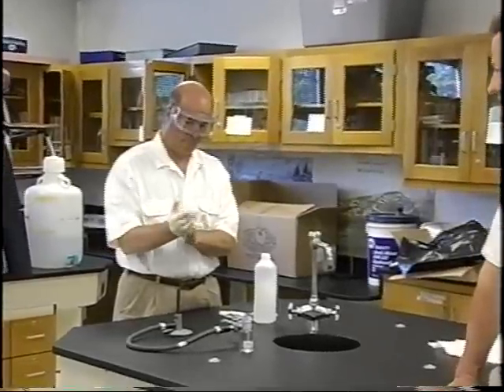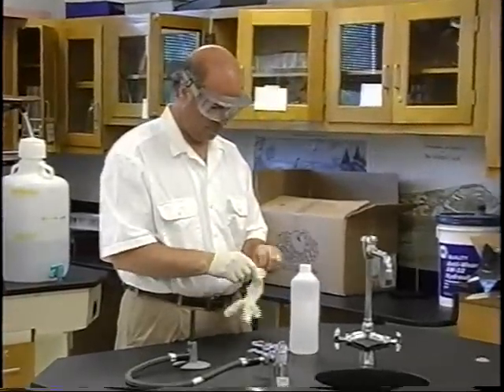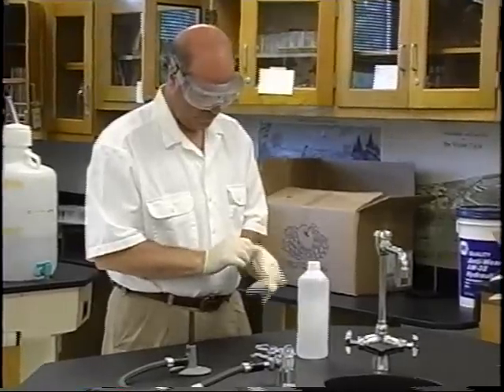Hi, we're back in the lab now. We're going to show you now the sterilization process of your lab table. In the background here, my able-bodied assistant is going to prepare himself to work safely by putting gloves and safety glasses on, as you will also. This kind of goes without saying, I'm sure you know.